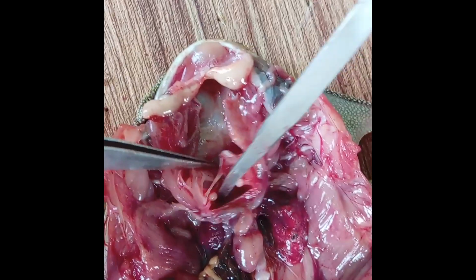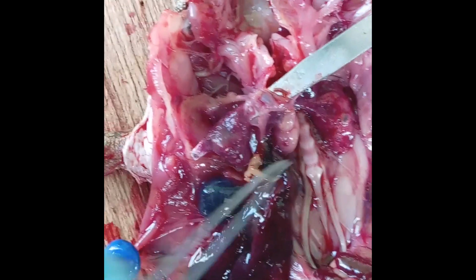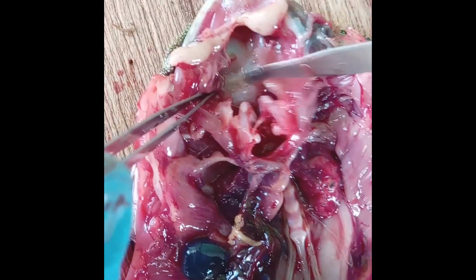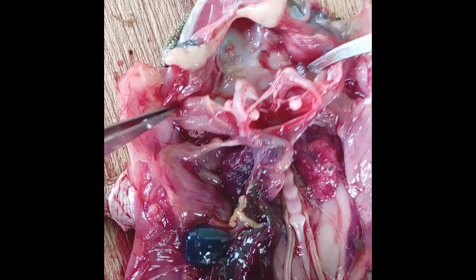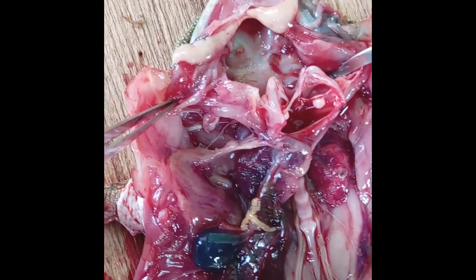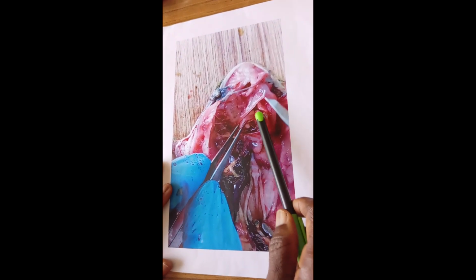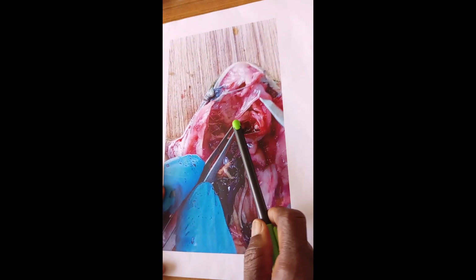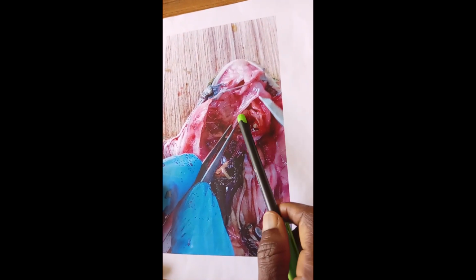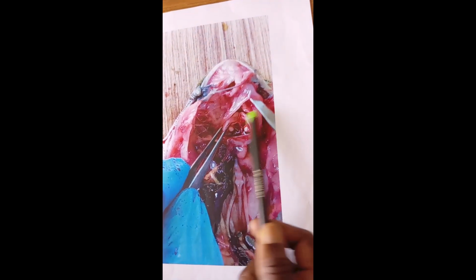Here is also the right lung. We see that the laryngotracheal chamber is connected to the buccal cavity and also the lungs to bring about breathing in the throat, but also sound in the chamber. Then here, these are the arytenoid cartilages. See, there are two. They form semicircular valves. When they are pushed aside, they open up and show the glottis.